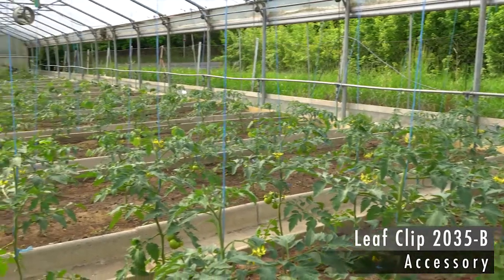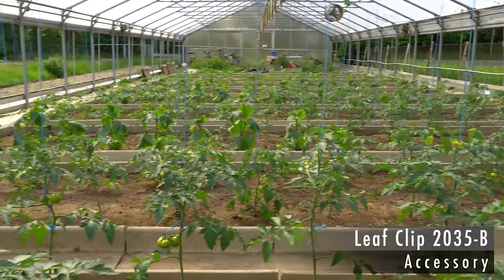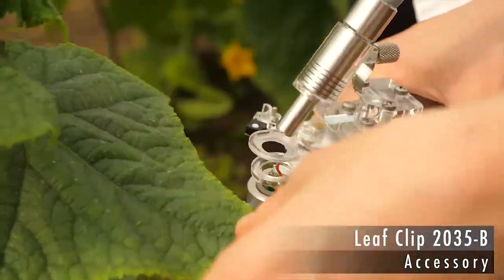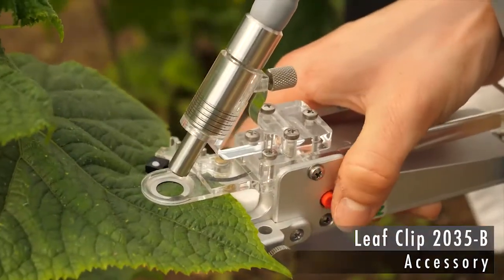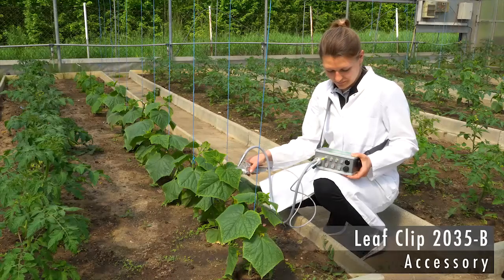Sabrina demonstrates the use of the field clip in another project where she investigates photosynthesis under ambient light. A single measurement simply consists of putting the field clip in place, then triggering the saturation pulse analysis by pressing the red button.